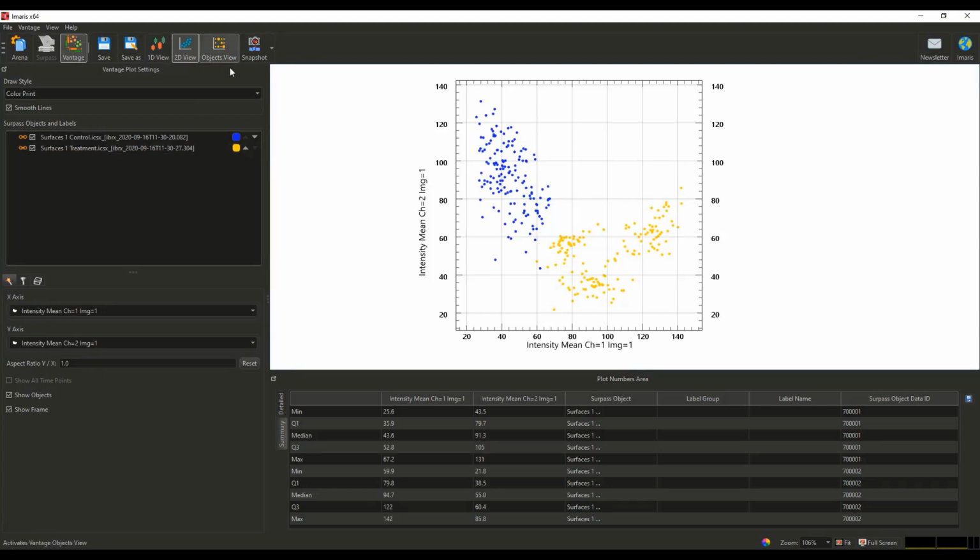Okay, so it's really here to compare data sets, so you have different setups of data sets, so results in one population against a second population. Here we did not have any label, but if you would have labels within a population, they would show up here.